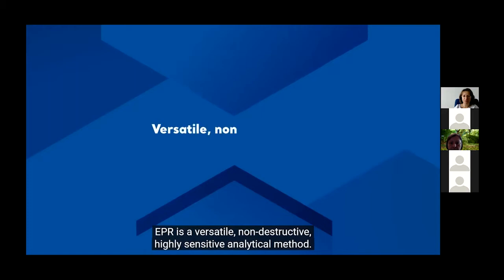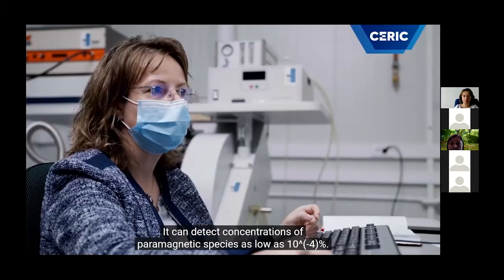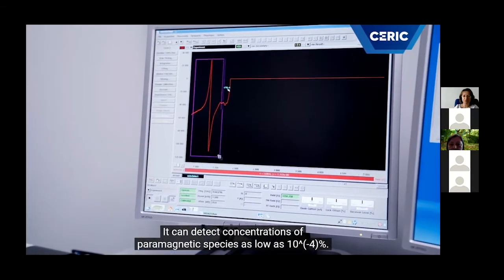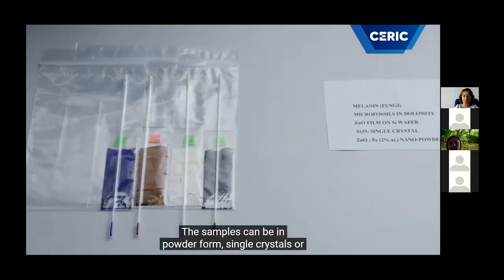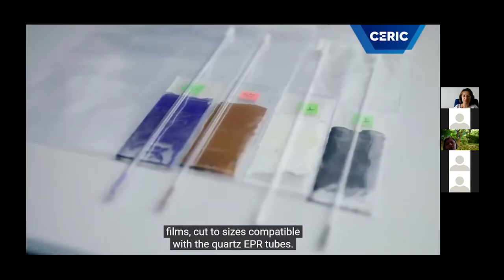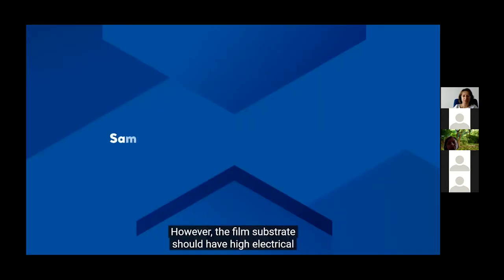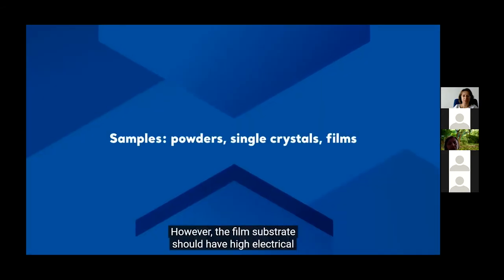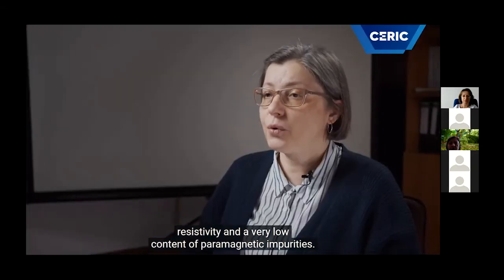EPR is a versatile, non-destructive, highly sensitive analytical method. It can detect concentrations of paramagnetic species as low as 10 to -4%. The samples can be in powder form, single crystals or films, cut to sizes compatible with the quartz EPR tubes. However, the film substrate should have higher electrical resistivity and a very low content of paramagnetic impurities.